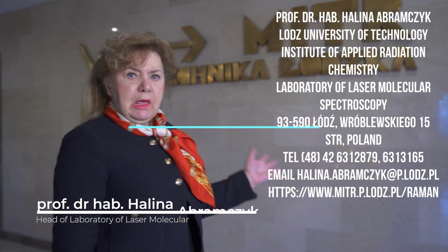We are in the laboratory of laser molecular spectroscopy of the Technical University of Łódź, and our laboratory consists of many laboratories using linear and nonlinear optics. We are involved in cancer and immunology research, and I will show our laboratories.